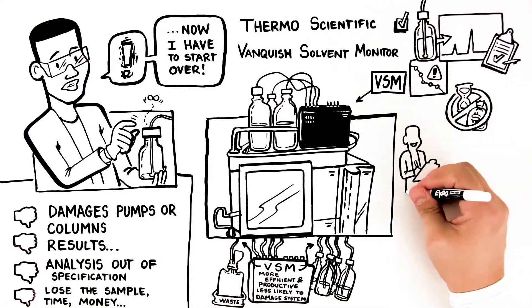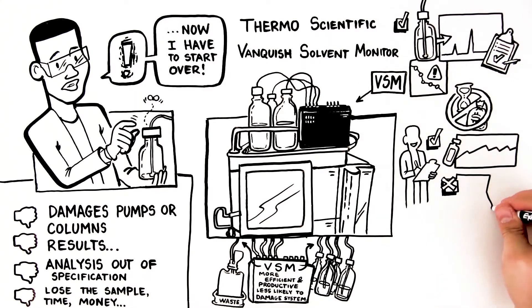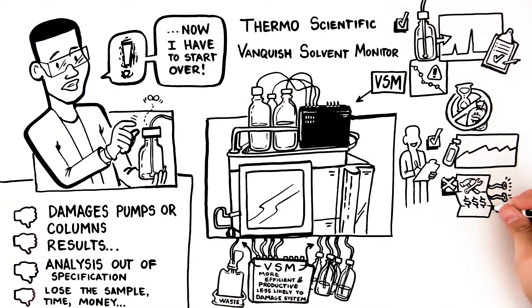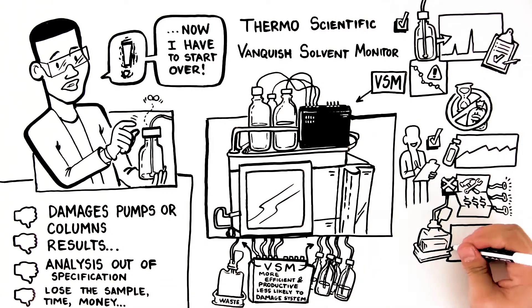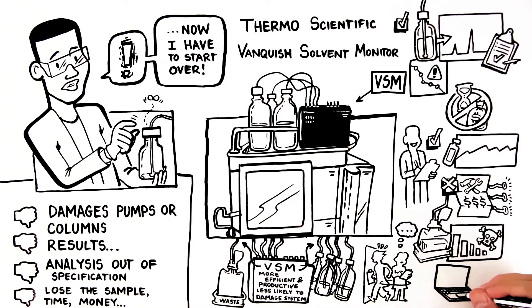Because you don't have to worry about your system running dry, you'll have longer column lifetimes and avoid the maintenance costs associated with worn-out pump seals. And because you can't overfill your waste, it lessens the chance that your lab will be exposed to hazardous waste. Finally, it eliminates the need to constantly walk in and out of your lab to check eluent levels, as you can visualize all the levels remotely.